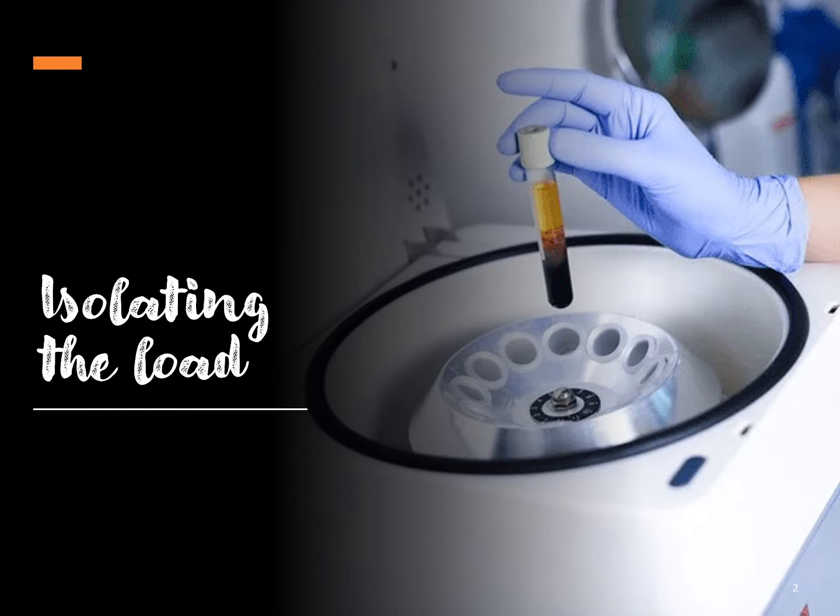Lysate from which the cellular debris has been removed, lysate from which the genomic DNA has been removed. This clarified lysate will now be known as your load, because this you're going to load onto these beads. Okay, so in this lecture we are going to talk about how to isolate the load. What should be your next step once you have lysed your cells?